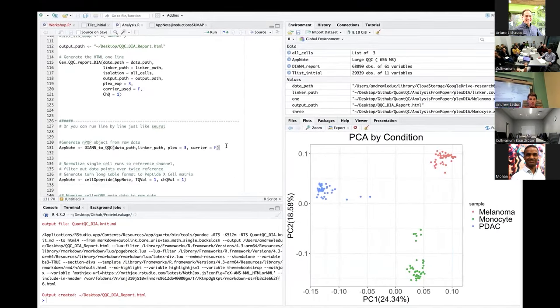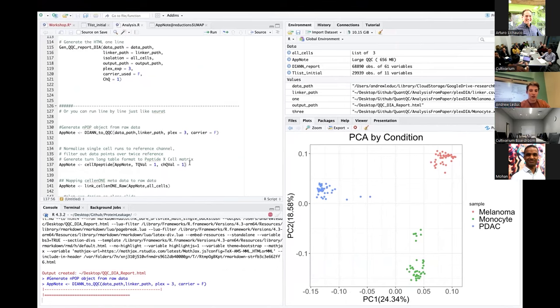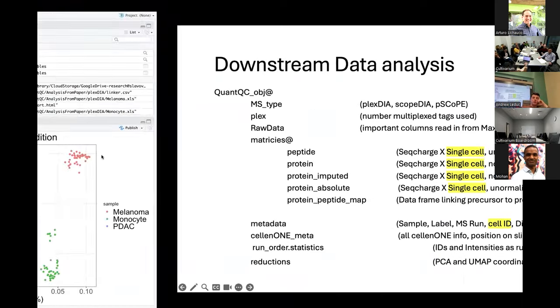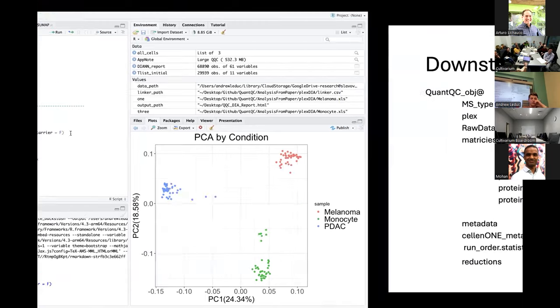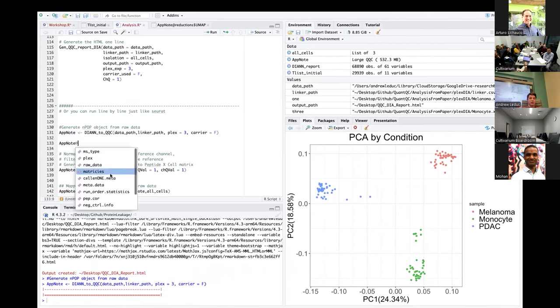You can also run it line by line, so if I wanted to have it in my R so I could access it. While we're here, you're going to generate this object here named AppNote, which is one of these S4 objects. So if I look at it and want to see what the different things in it are, I can type at and see all the different attributes.